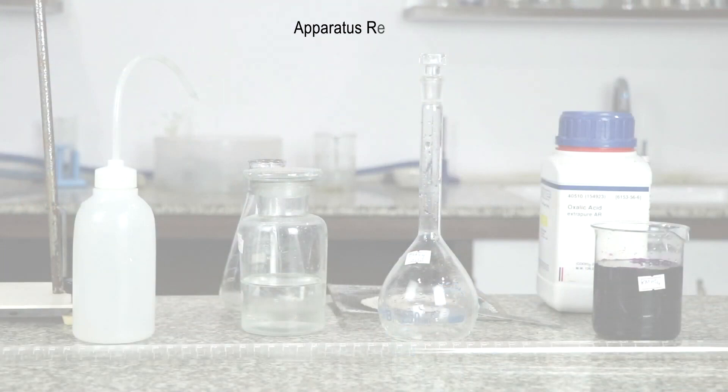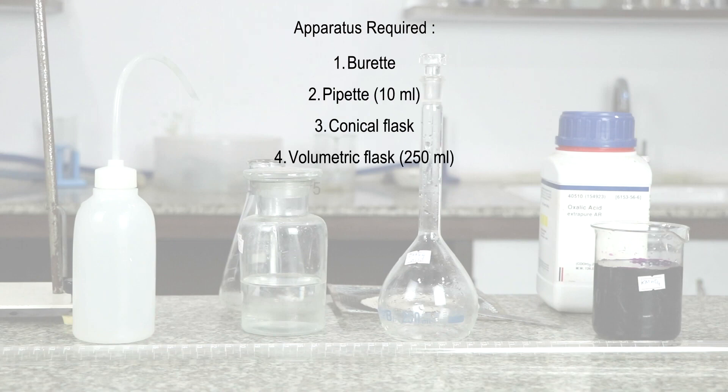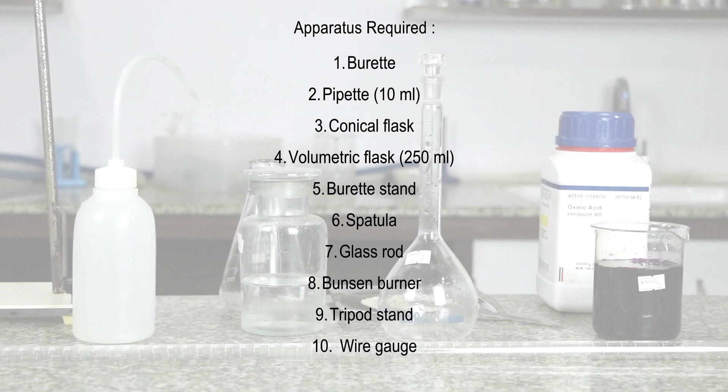The apparatus required are burette, 10 ml pipette, conical flask, 250 ml volumetric flask, burette stand, spatula, glass rod, Bunsen burner, tripod stand, and wire gauge.